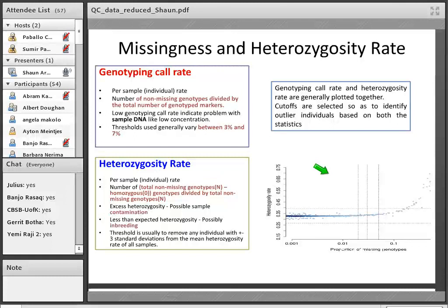Missingness is the genotype call rate per individual — the number of non-missing genotypes divided by the total number of genotype markers. If a sample has a lot of SNPs that have not been genotyped, it's an indication that something might have been wrong with that sample — perhaps low DNA concentration or poor sample preparation. Generally the threshold we use is: if a sample has greater than 3% to 7% missingness, we say it's likely that sample was not genotyped properly and we'll exclude it.